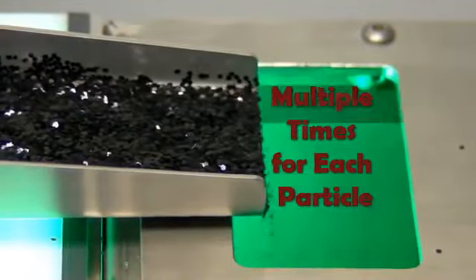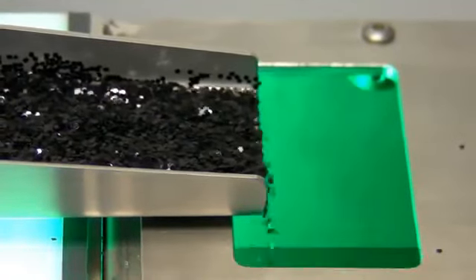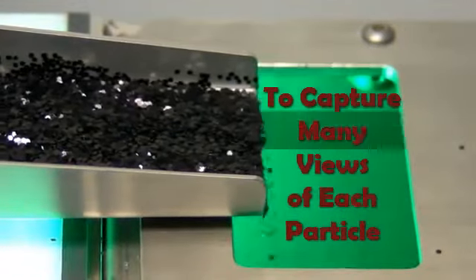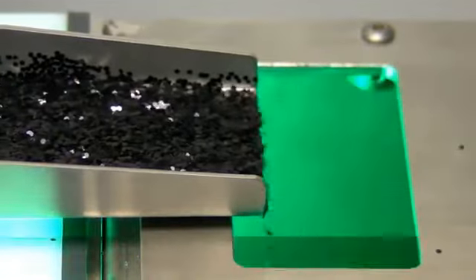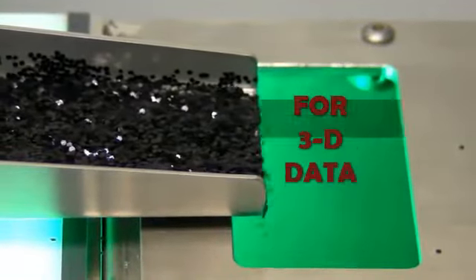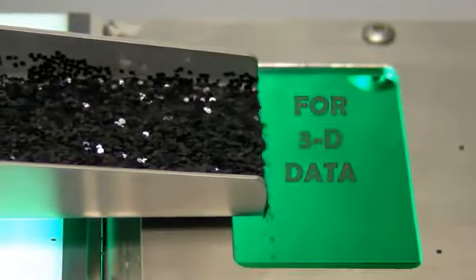Multiple photos are taken of each particle as it tumbles through the zone. This captures many views or orientations of the tumbling particles. And that's what gives us the three-dimensional data unique to this analyzer.